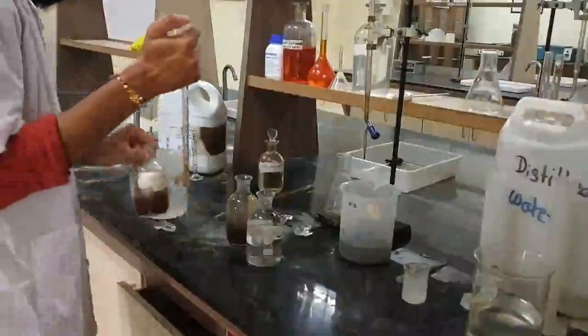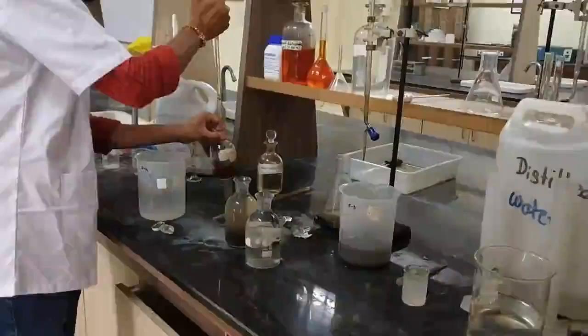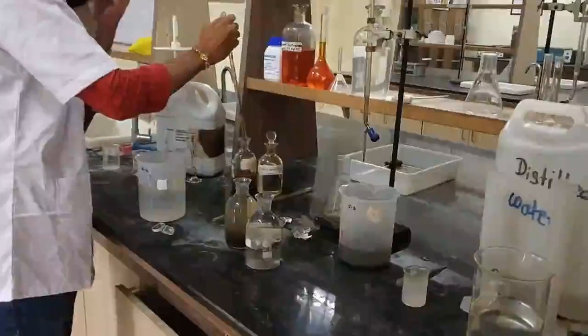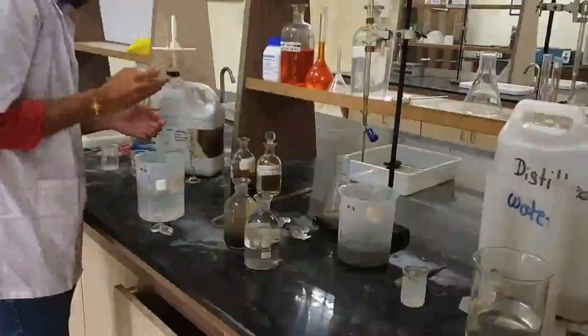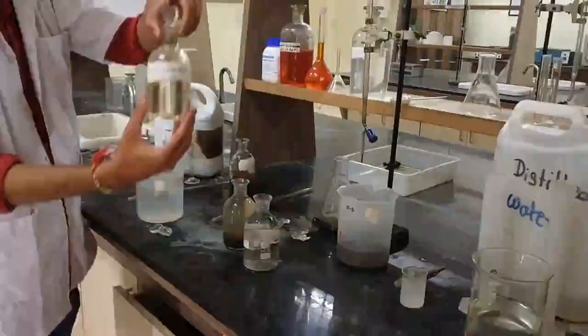We have added 2 ml of manganese sulfate in both of these bottles. With a separate pipette, we are going to add alkali iodide azide. The volume is 2 ml in both of the BOD bottles.